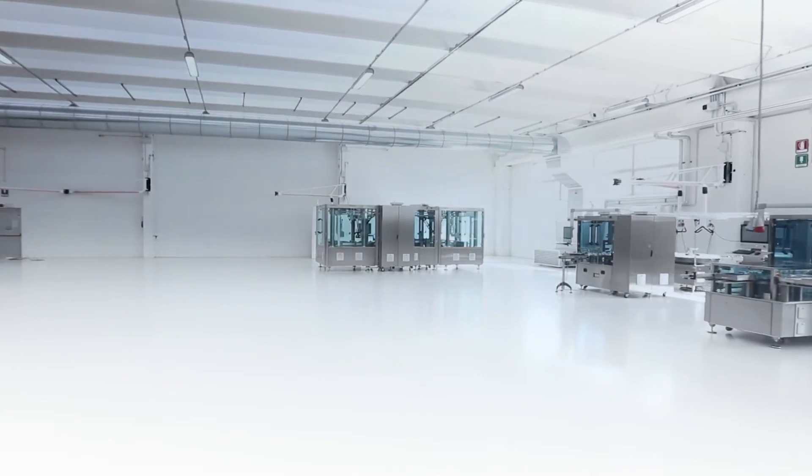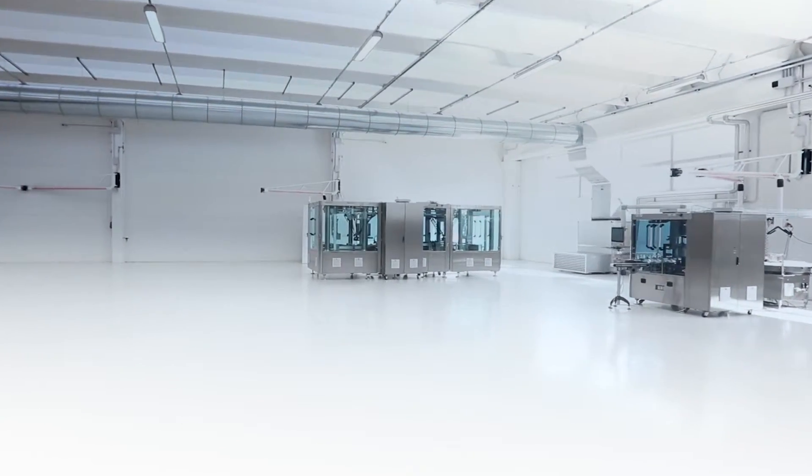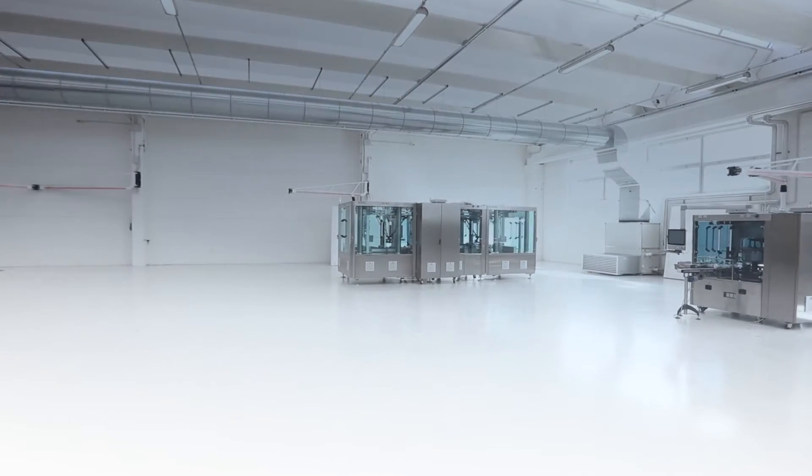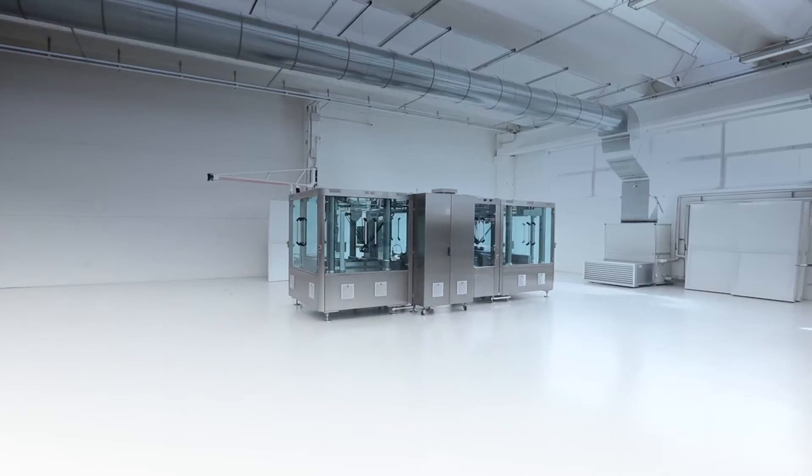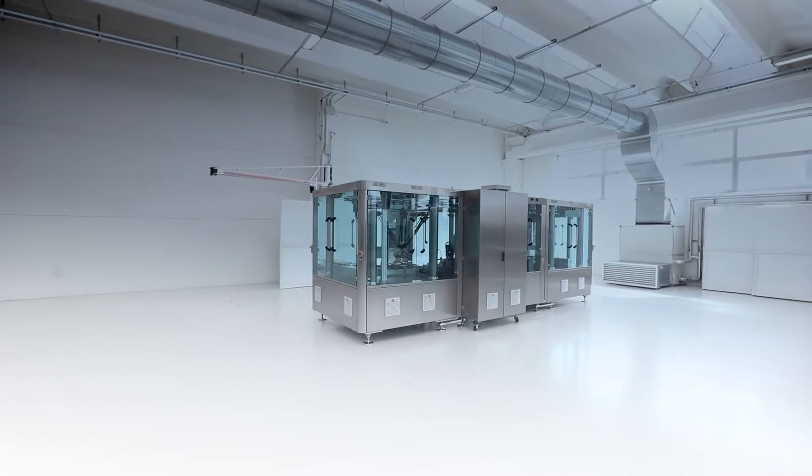Breveti Chea has combined years of research and development into a single integrated inspection machine, defining once again the new standards in terms of inspection, performance and efficiency.